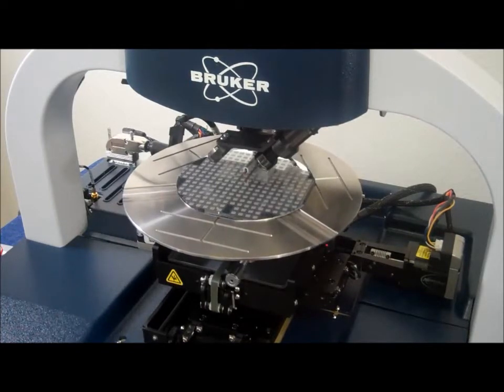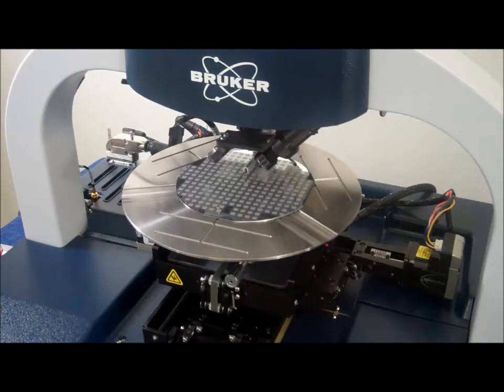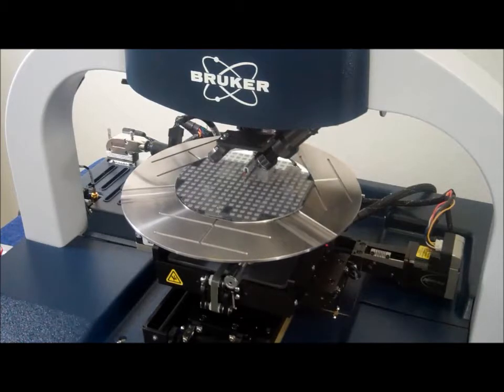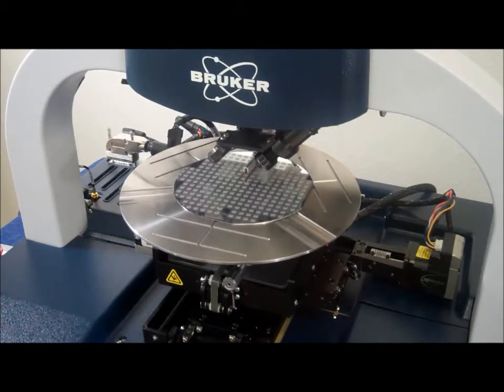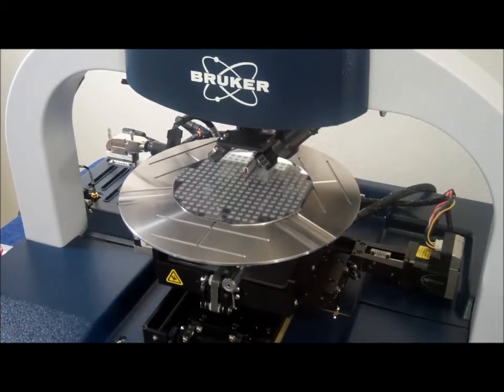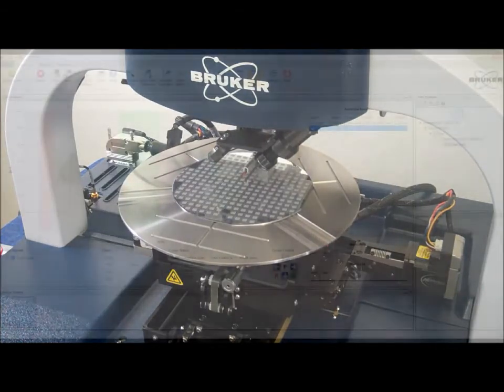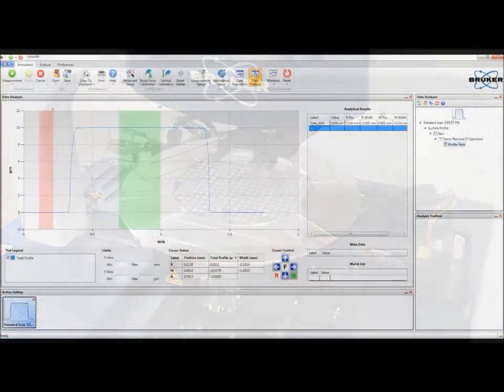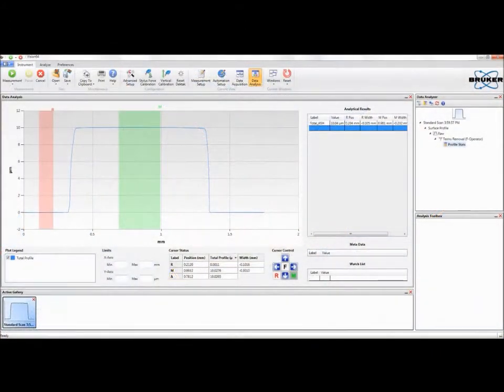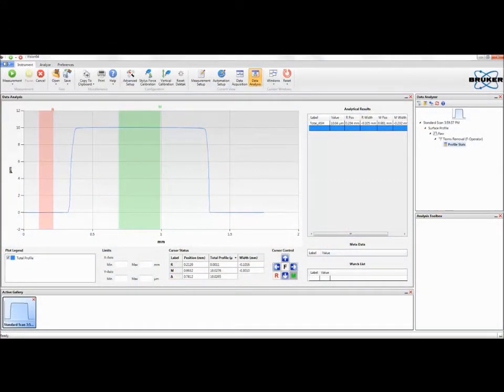The stylus is linked to a linear variable differential transformer, or LVDT, which produces electrical signals that are processed and correspond to height variations of the sample. This analog signal is converted to a digital signal, and these surface variations are stored, displayed, and analyzed on a PC.